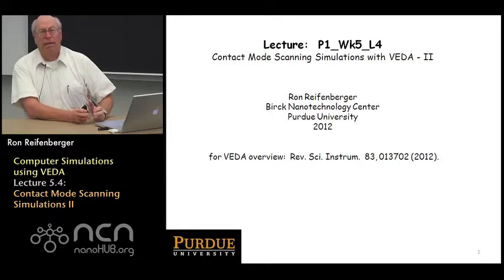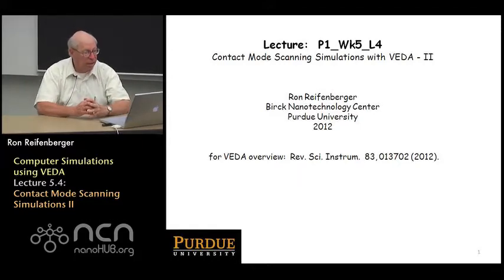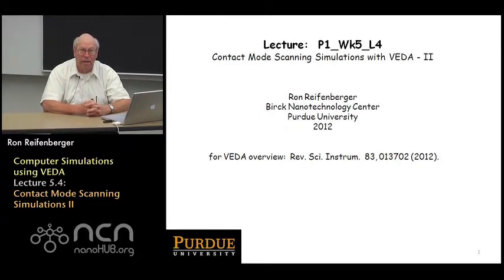Hi, we're back again, and we're going to continue discussing contact mode scanning simulations with VEDA. I've put together a number of simulations that perhaps will give you some insight into how the tip behaves when you raster the tip over different features in a substrate.